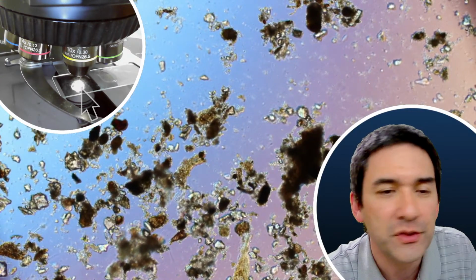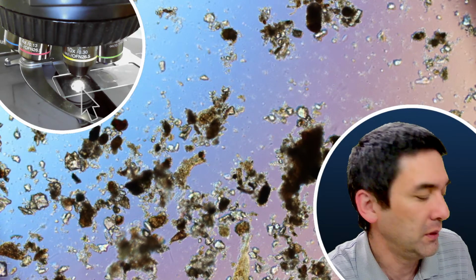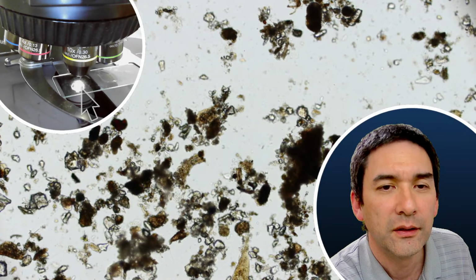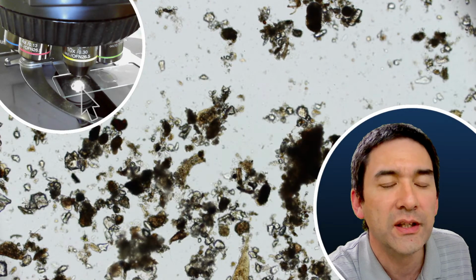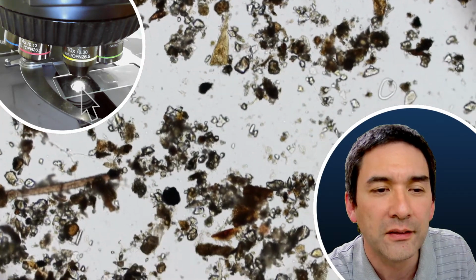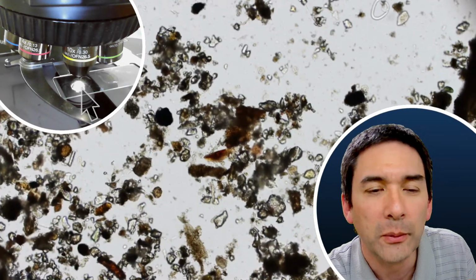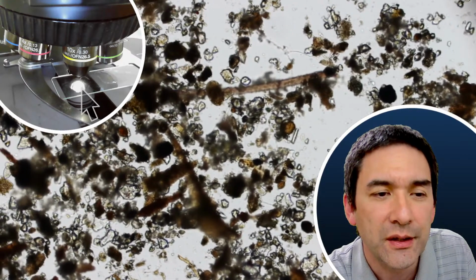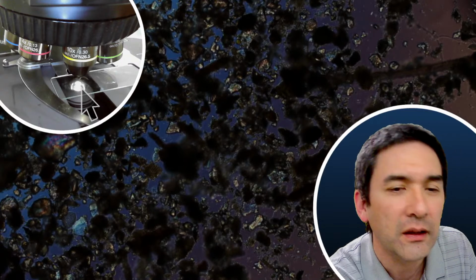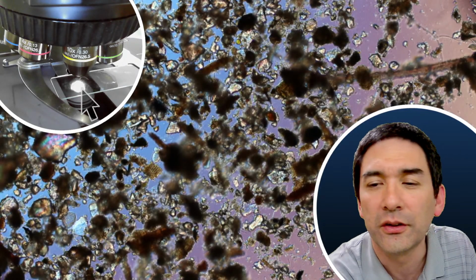So what I can do, for example, right now, is remove the filter here, and then you're going to see that this is a regular bright field, and it looks a little bit more flat. This is probably the way that most of you are going to see the image, because it's in bright field, but I've got this little thing here which gives it a little bit more color as well.